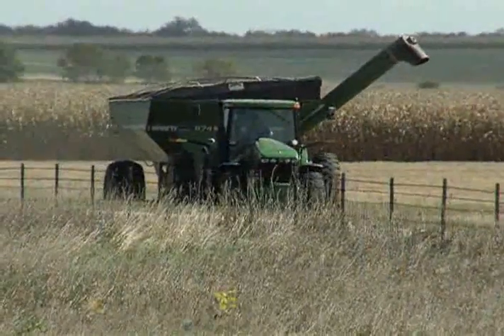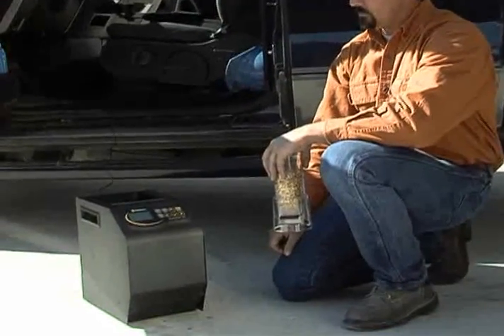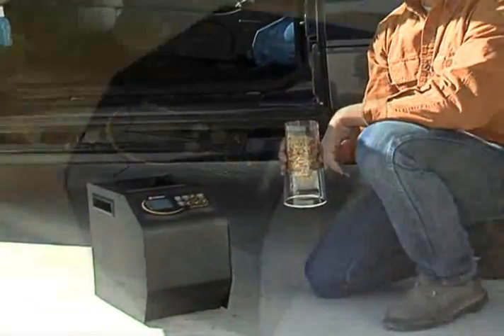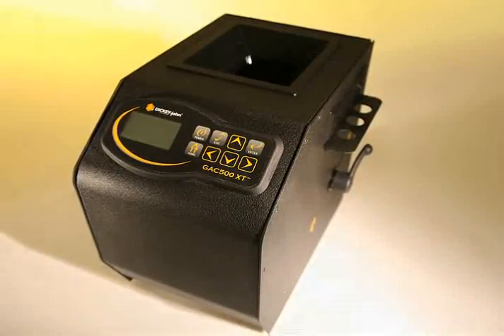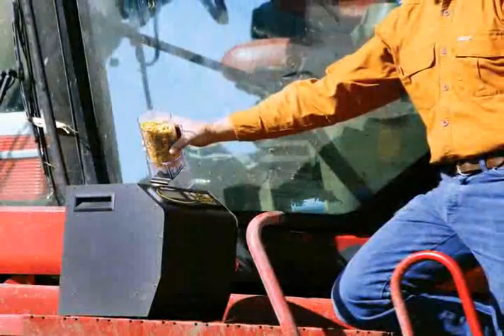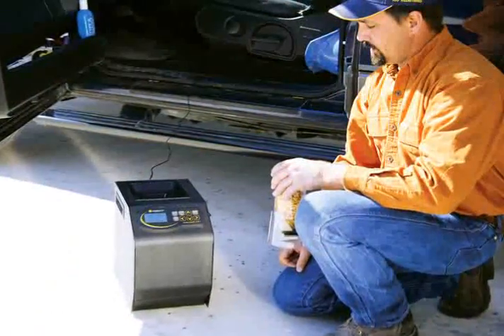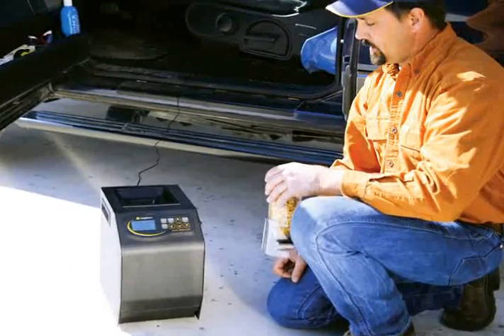Take elevator quality testing anywhere on the farm with Dickie John's versatile GAC 500 XT grain analysis computer. Compact and cost effective, the GAC 500 XT lets you analyze grain for moisture, temperature, and test weight where you choose — at your farm, in the field, or wherever you and your truck happen to be.